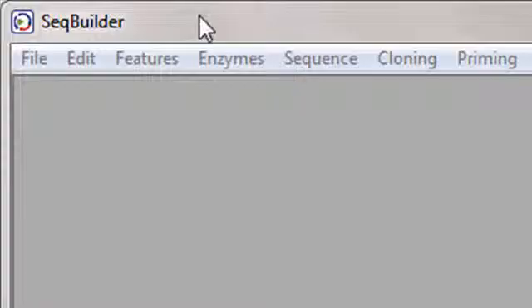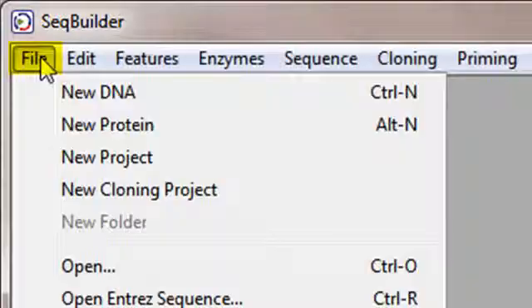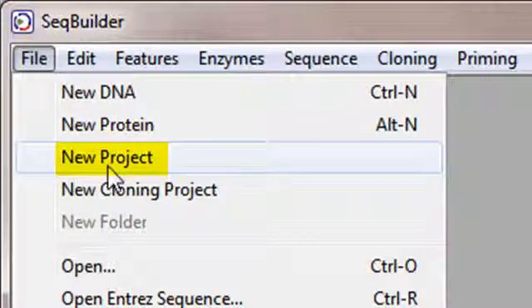To import my Vector NTI sequences into SeqBuilder, I'll start by opening a new project using the File New Project command.